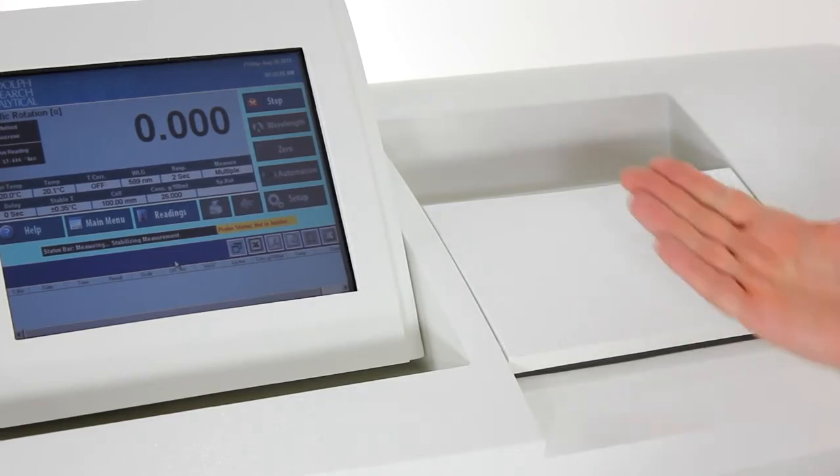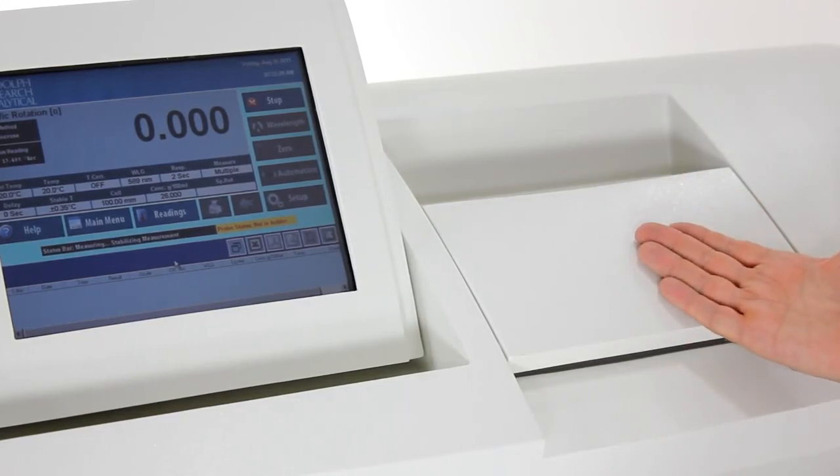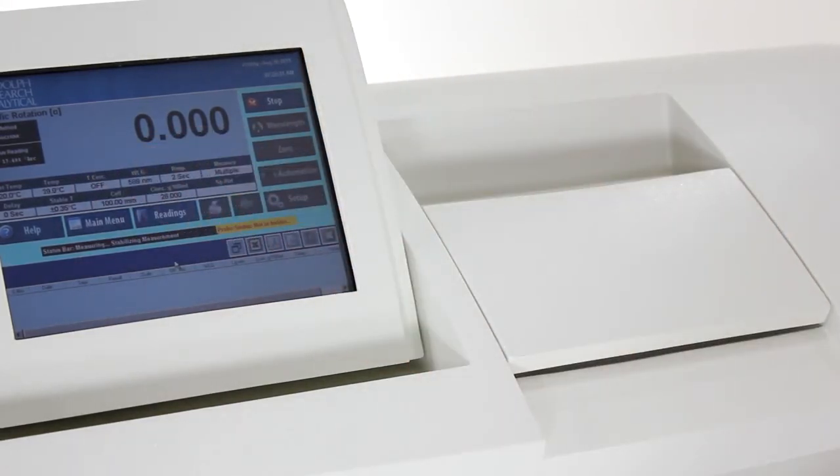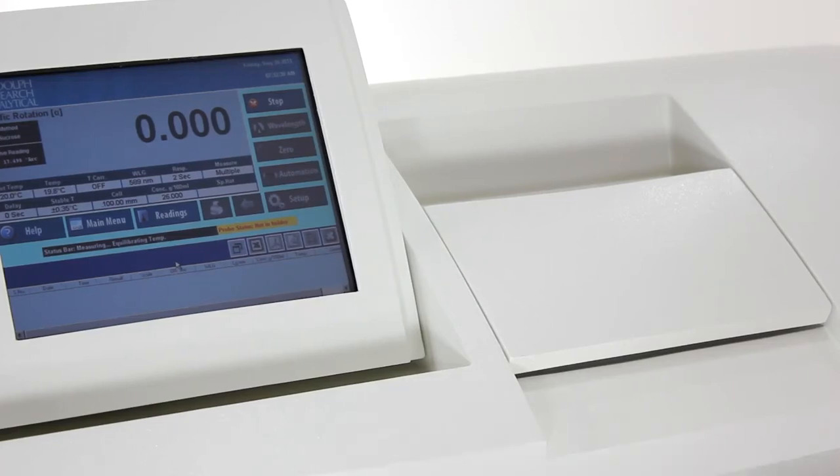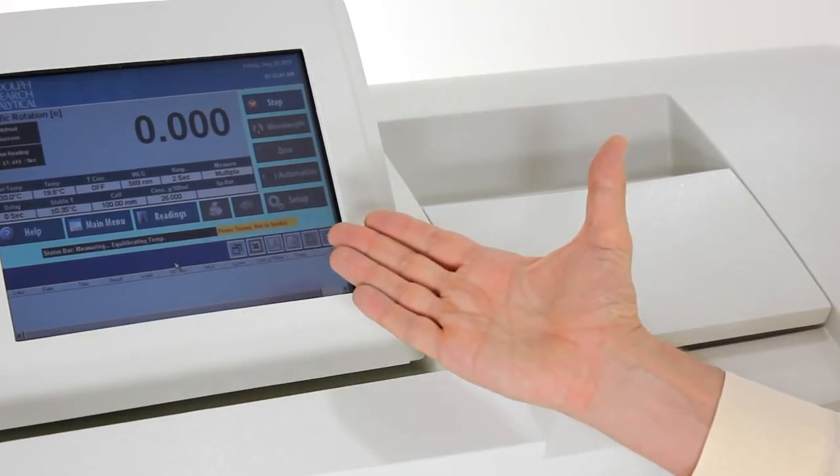The system now will bring the sample to the required temperature. For sucrose this is 20 degrees. For other materials it may be 25 or even at different temperatures. When the sample is stable at the required temperature it will measure.